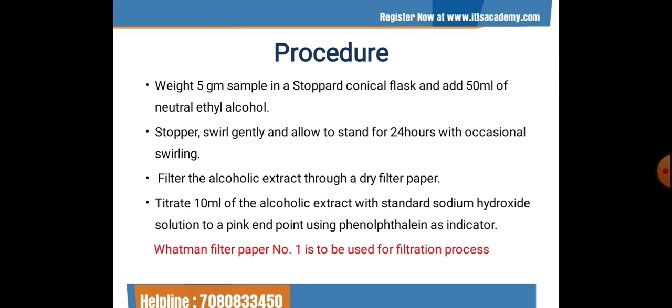in this, a solution, the so-called titrant or standard solution, is added to the sample to be analyzed. The titrant contains a known concentration of a chemical which reacts with the substance to be determined. The titrant is added slowly by means of a burette. A burette is a device which allows the exact measurement of the quantity of titrant added. Due to the chemical reaction taking place in the sample to be analyzed, the characteristics of the sample change. We can judge it by the change of color.